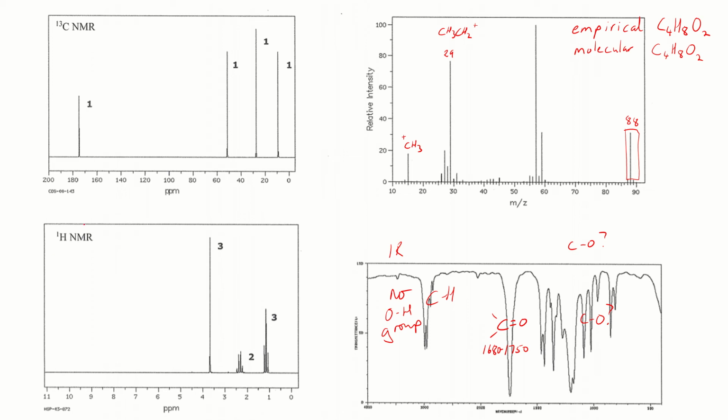Now, proton NMR is the most powerful. To be honest, most of the molecules being fairly simple that you get, you can figure out with just this. But we'll try and use them all just for, again, good, thorough analysis of it all. So I'm going to come on to carbon-13 next. Now, this peak up here is of interest to me.